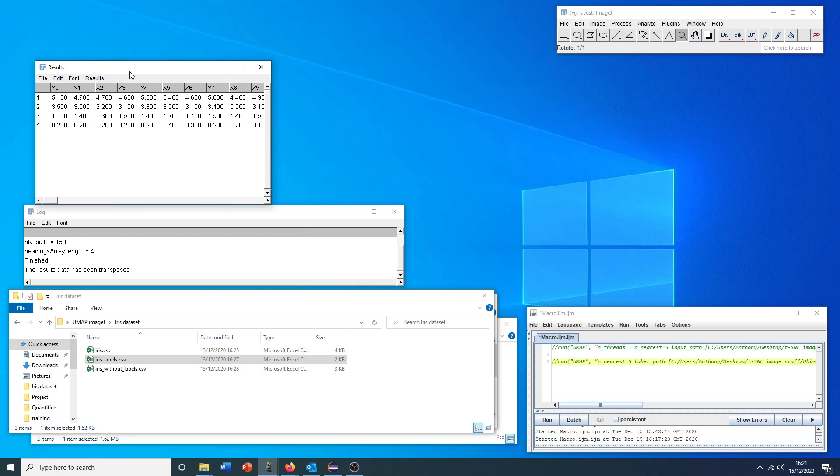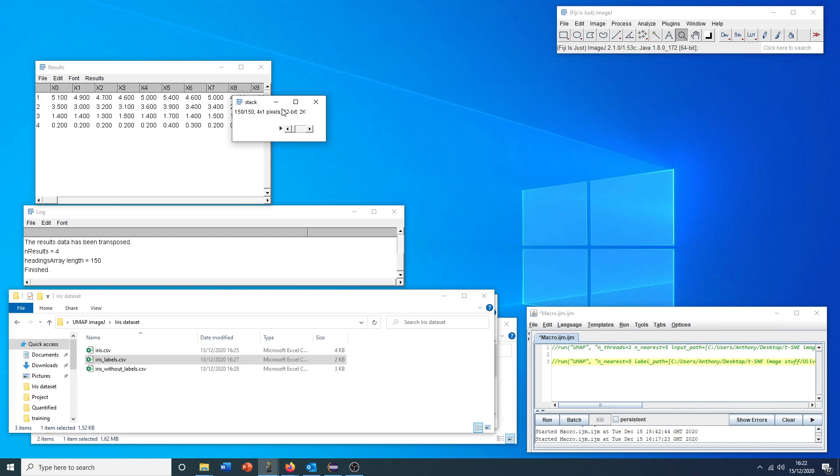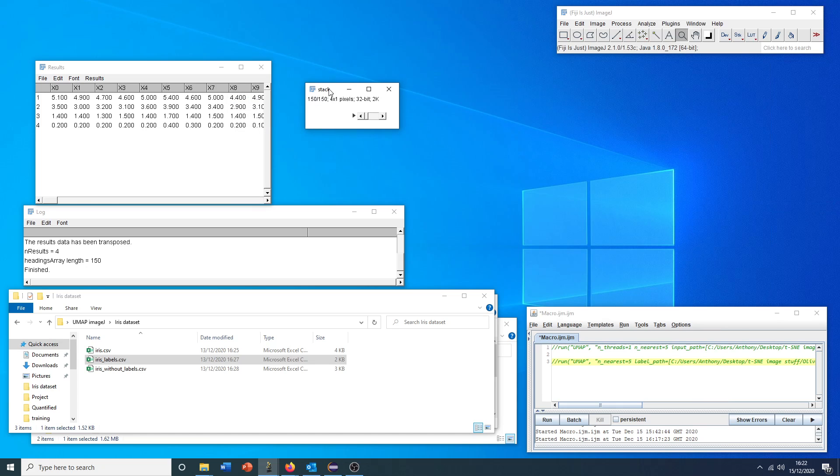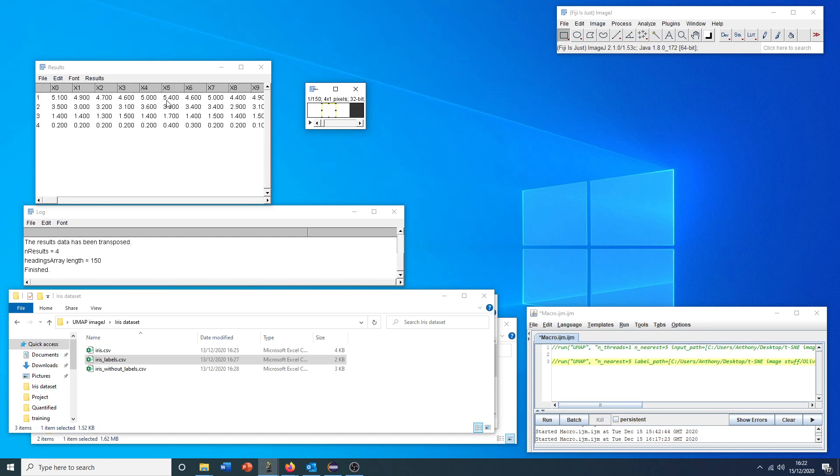With this, we can now go to plugins, dimensionality reduction, results to stack. And here we go. This stack is now the exact format that we want to run our dimensionality reduction tool on. Each of these pixels is actually these numbers encoded. We don't need our results table anymore.